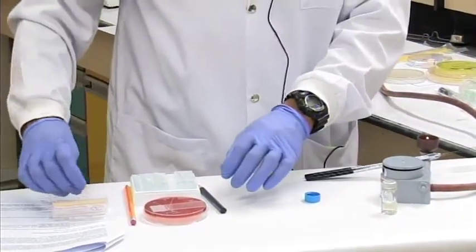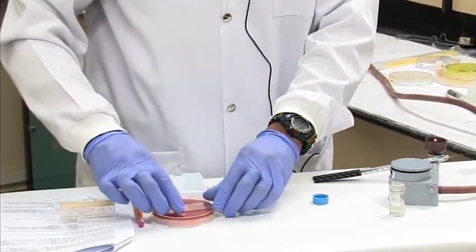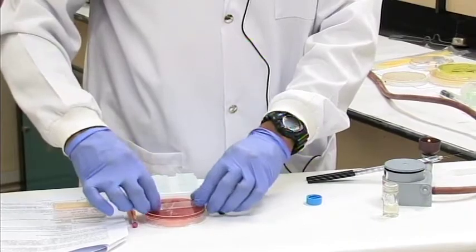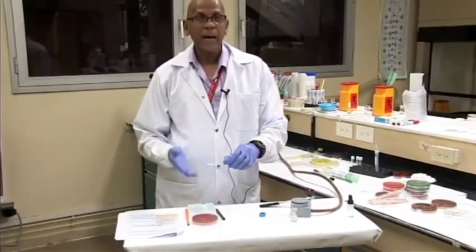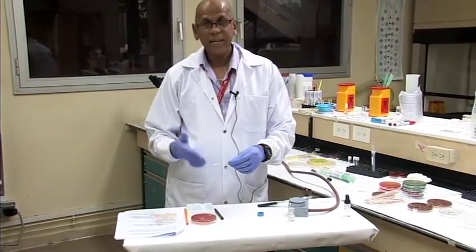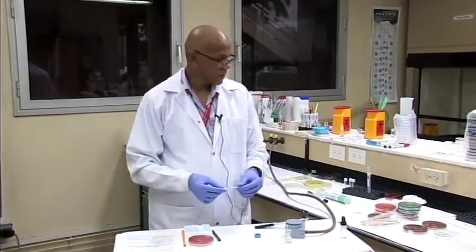And then apply a cover slip or cover glass again to it to create what we call a wet preparation. Again, we put this under the microscope under times 10, times 40, and look for things like, as I said, for example, Trichomonas, Candida, and so on.